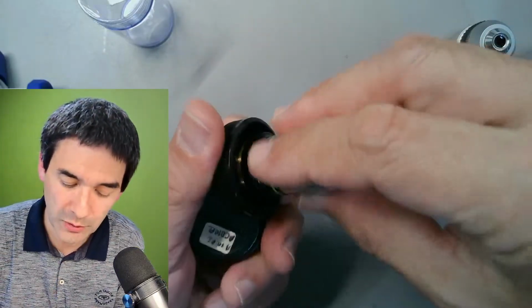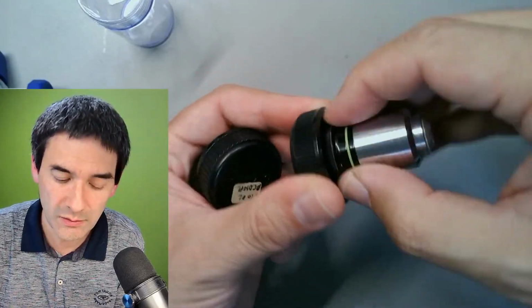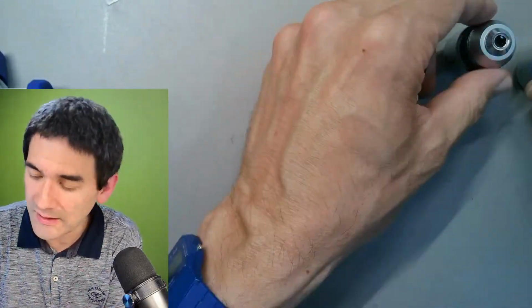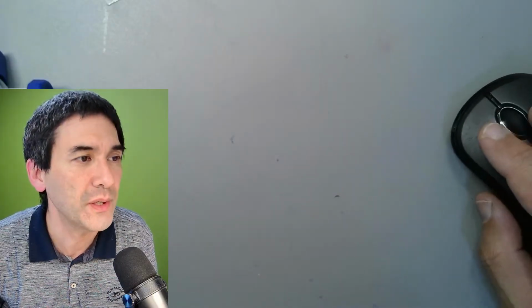Of course, you always want to make sure that they're properly stored away, dust-free and protected. I'm going to do this later. Okay, so let's put it somewhere over here. Oh yeah, by the way, I was also thinking about talking a little bit about LED exchanging of microscope lamps and so on.